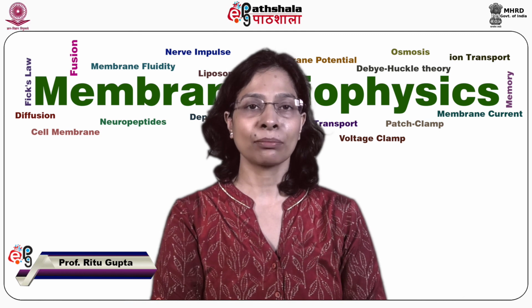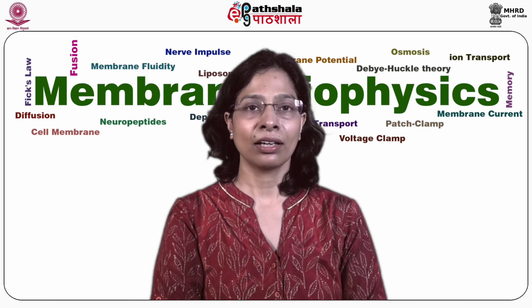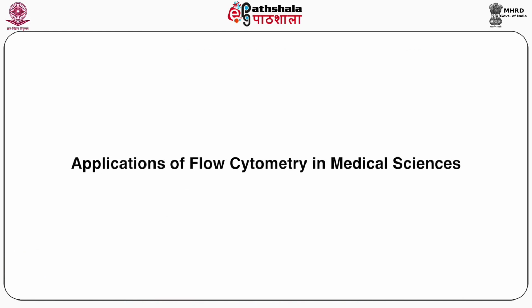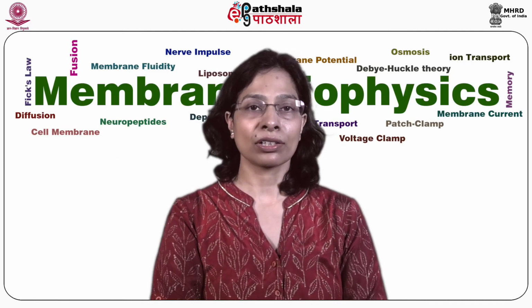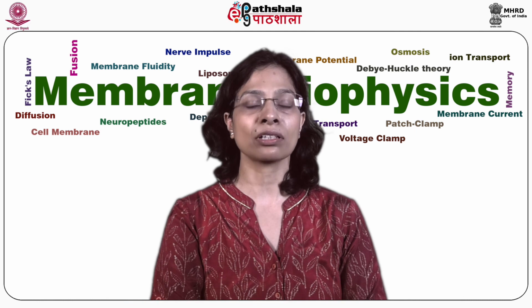I am a professor in laboratory oncology at All India Institute of Medical Sciences, New Delhi. I will be discussing the module on applications of flow cytometry in medical sciences. Flow cytometry is the technology that allows rapid analysis of multiple characteristics of single cells in qualitative and quantitative manner.